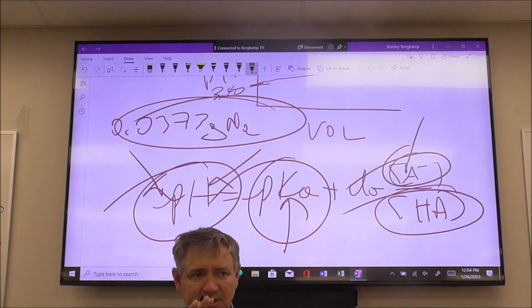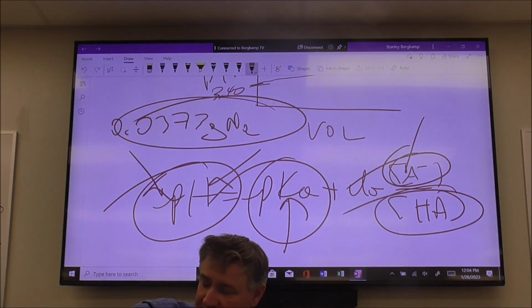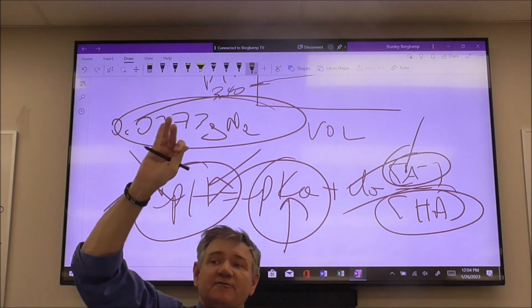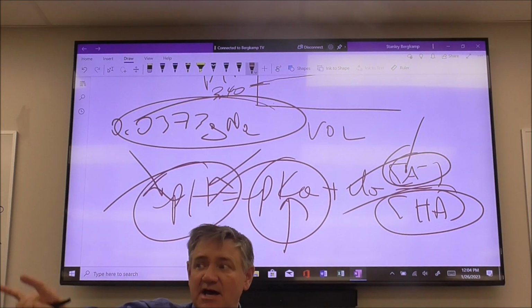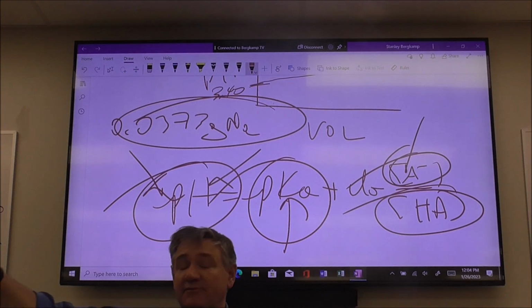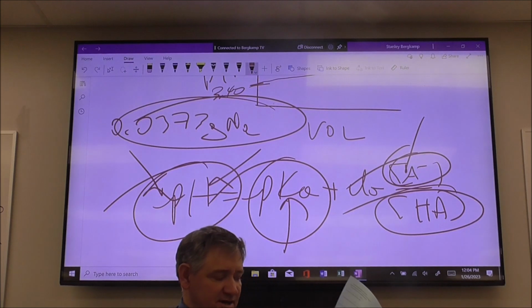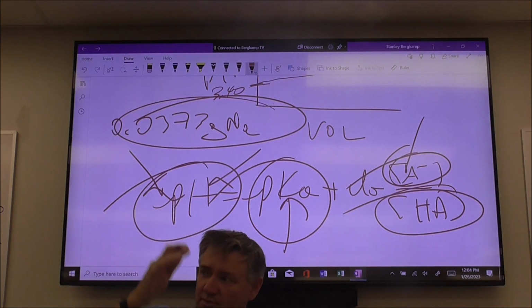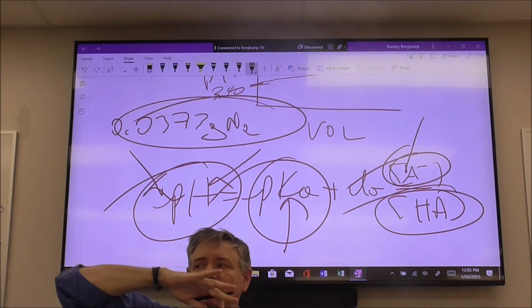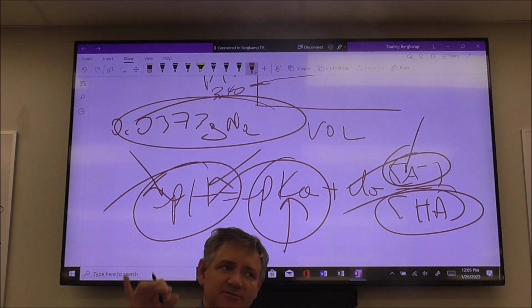So what you want to do today, add the amount of sodium acetate that I tell you to, and generate that pH curve. Figure out how much sodium acetate you have to add to make a buffer with a pH of 6. Get that one done. Do these calculations on 9 and 10, add that, mix up, and see what happens to the pH. Everything else is just based upon calculations. So that's the stuff that you have to do in the lab today.